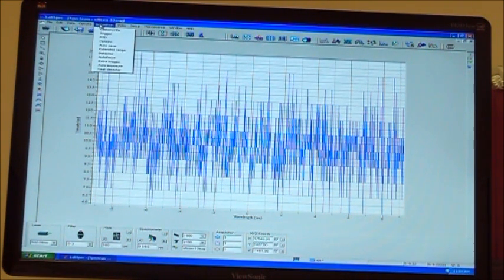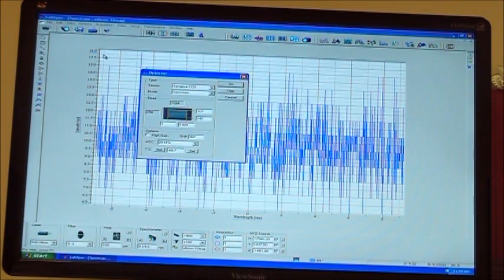Next, acquisition, extended range detector. Here in detector, this represents your CCD detector chip. It shows you what your chip is set for, the temperature, which pixels you're using, and everything else. I recommend, other than the temperature in here, which is at the bottom of the window, that you don't change anything. If you know a tornado's coming and you need to power the whole system off, you would open this detector window to warm the detector.